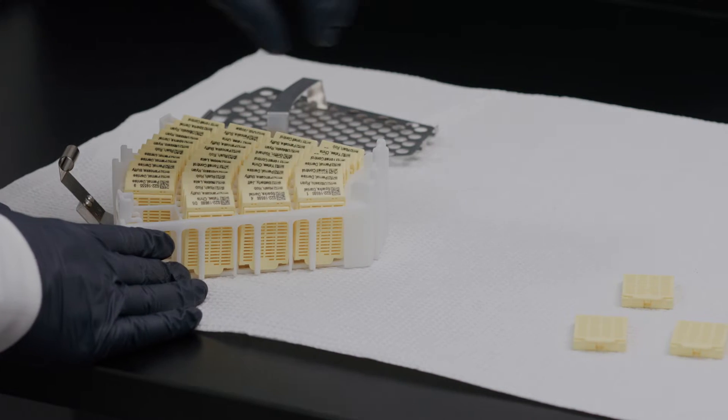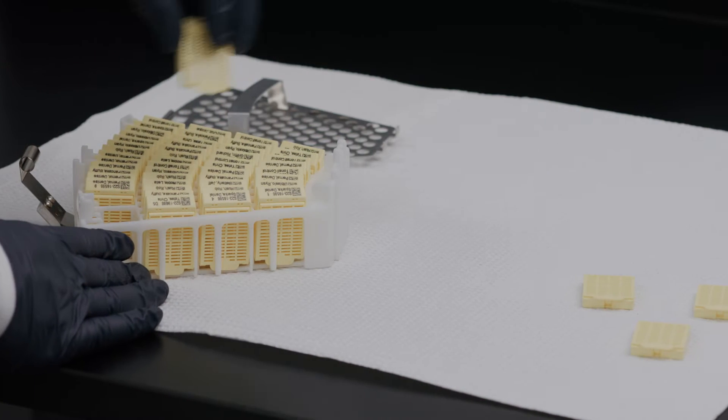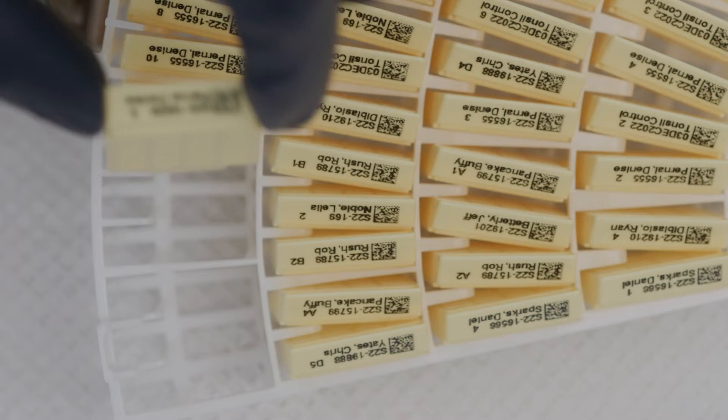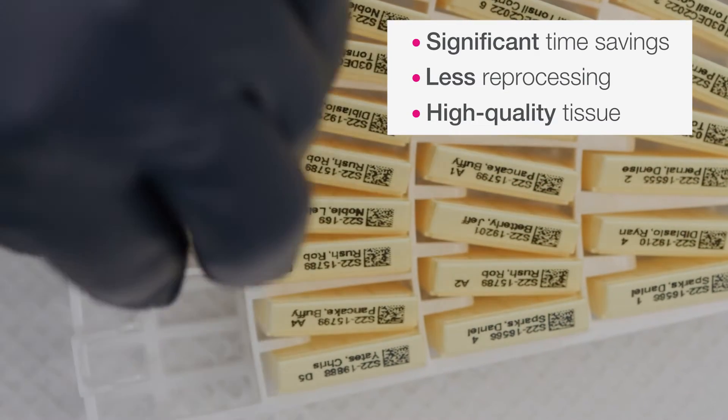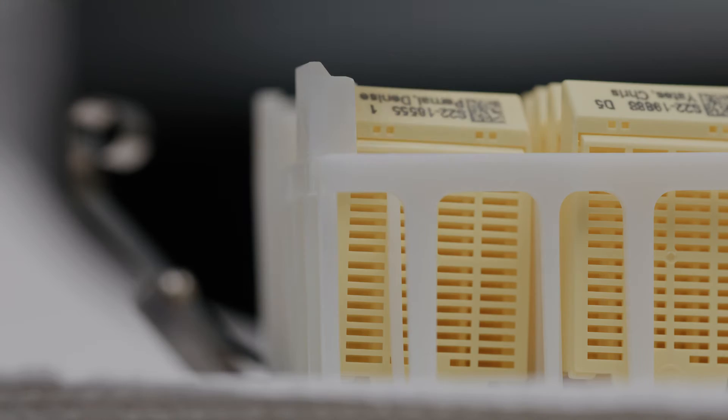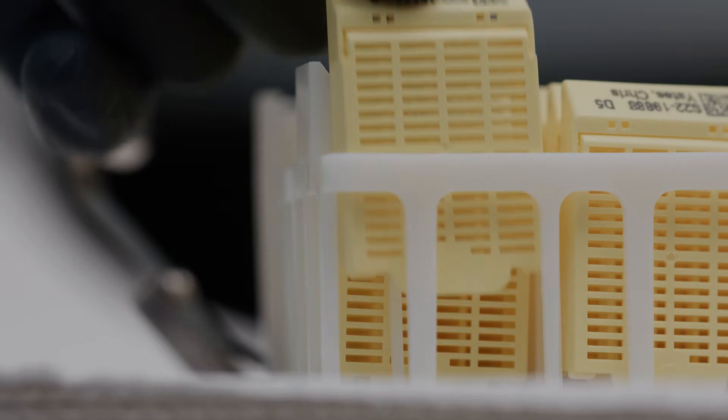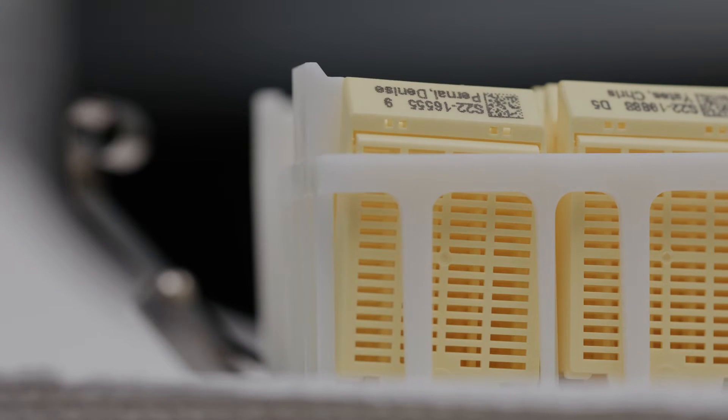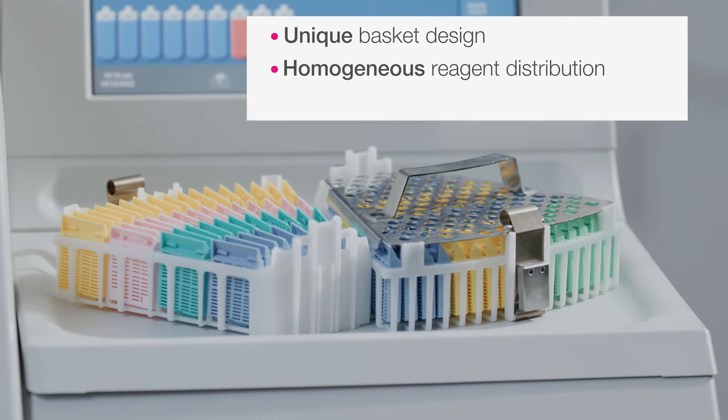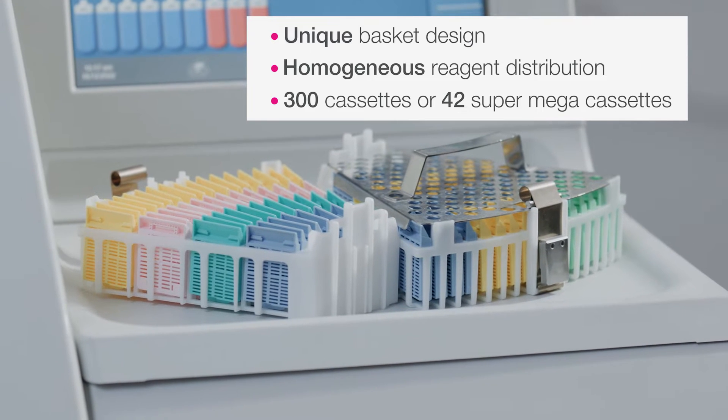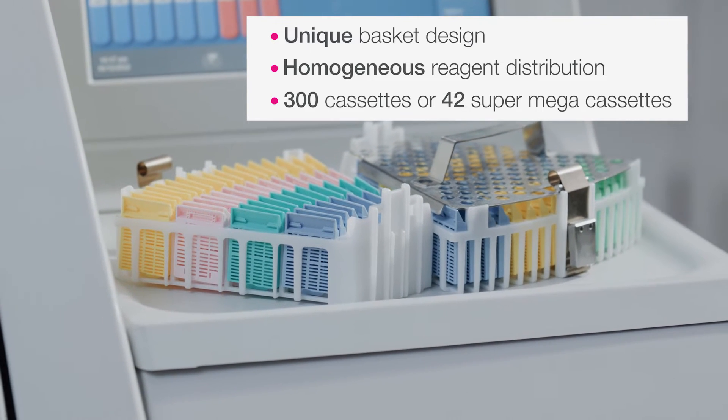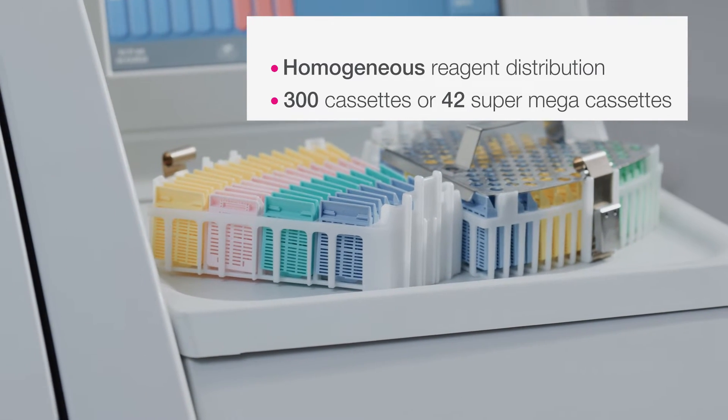You can be assured that the Revos system can fulfill your requirements for immunohistochemistry and molecular assays. The Revos system's baskets were designed to optimize the space between tissues, allowing water trapped in the tissue to be removed and replaced by the appropriate reagents. This occurs more efficiently than in systems using conventional baskets. The Revos cassette baskets were uniquely designed with individual spaces for each cassette, promoting fluid exchange and providing personalized tissue processing to each patient.